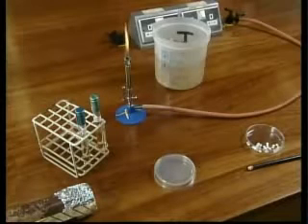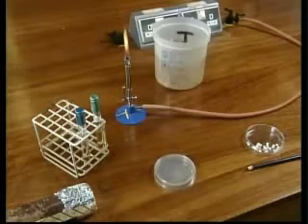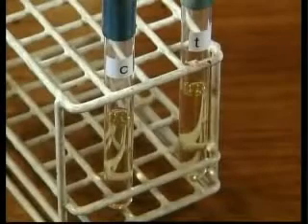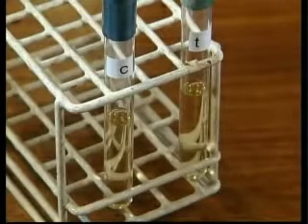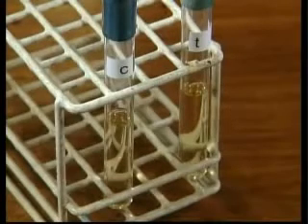Bacterial susceptibility to antibiotics can also be tested using a controlled sensitivity test. The susceptibility of the test culture is compared with a control culture of bacteria known to be sensitive to the antibiotic to be tested. Both cultures are diluted to approximately 10 to the 5 colony-forming units per ml. This concentration of cells will give a semi-confluent growth.